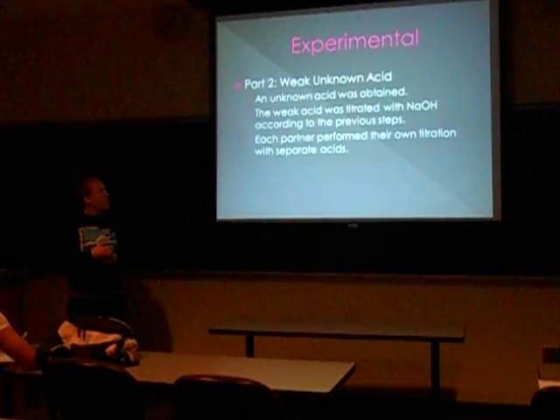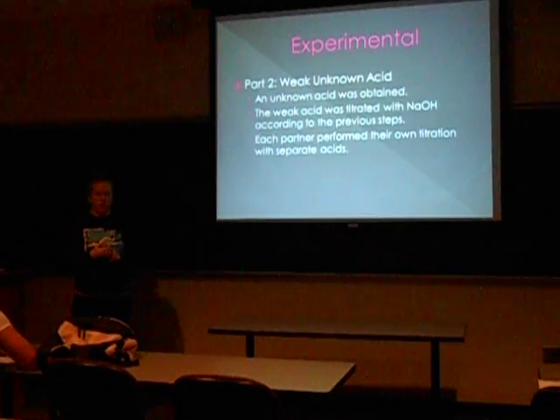Part 2 was the weak unknown acid. We each obtained a weak unknown acid. Both of us had different unknowns. It was titrated with NaOH following the previous steps.